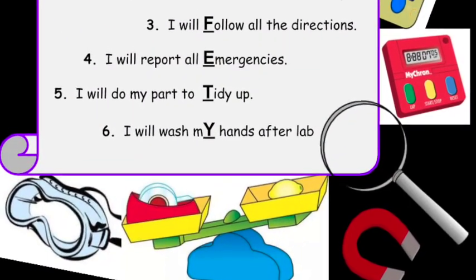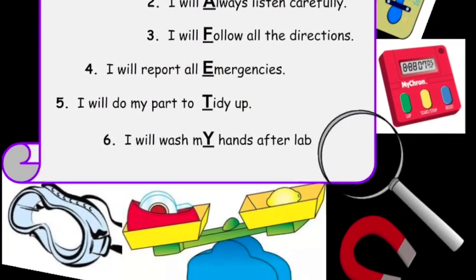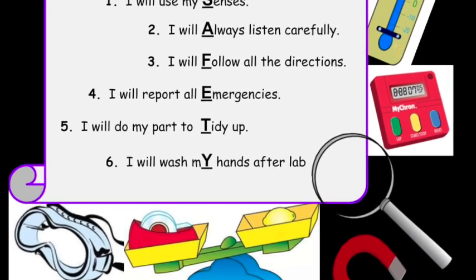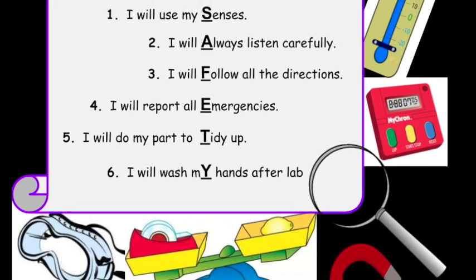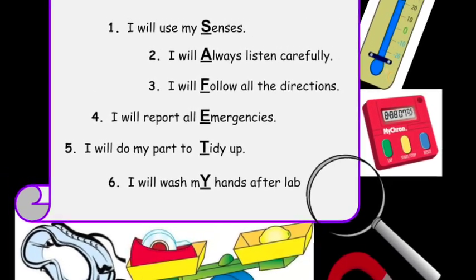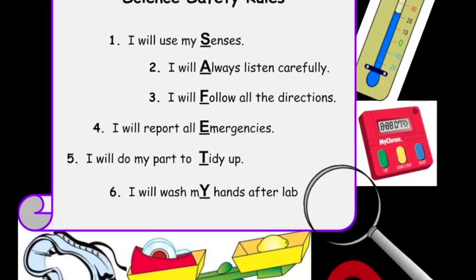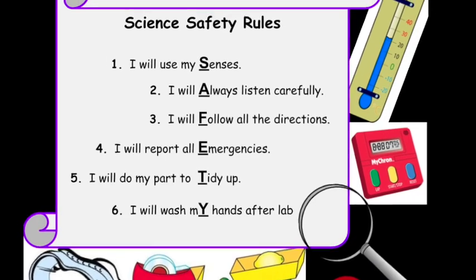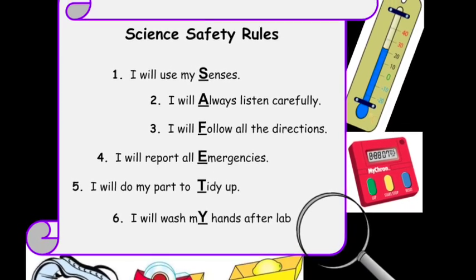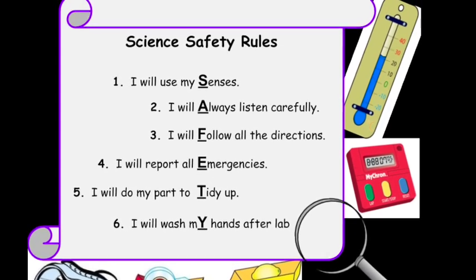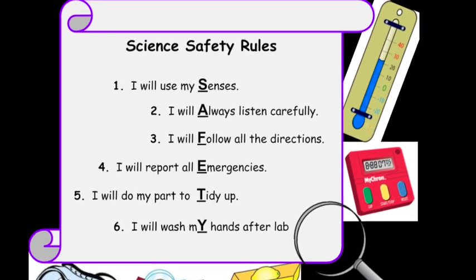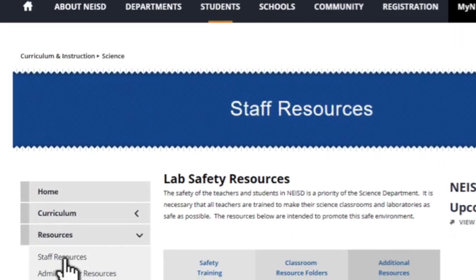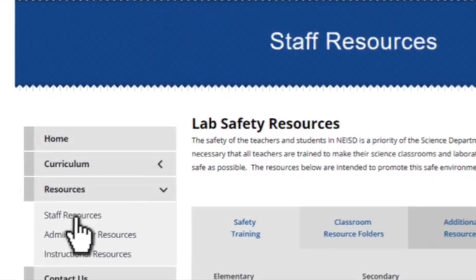It is also a good idea to provide students with a written set of safety rules and a contract for both the student and the parent to sign. Links to the safety contracts can be found in this training and on the staff resources page of the NEISD Science website.